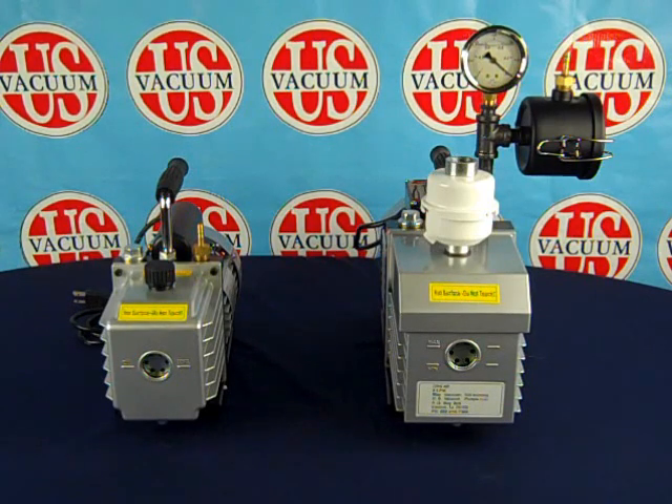Here we have two different pump setups, representing our standard pump offering and one with installed optional accessory items. On the left, we have our standard pump package. This package includes the vacuum pump with carrying handle, on-off power switch, power cord, hose adapter, and discharge muffler.